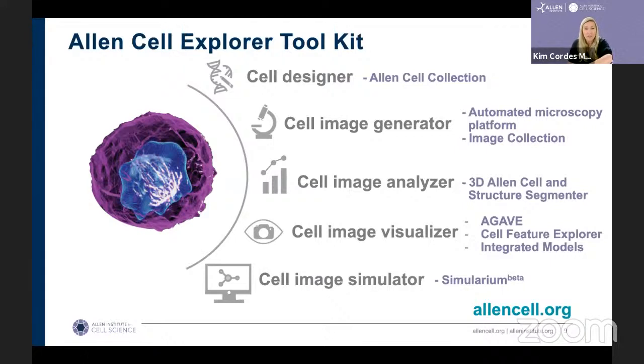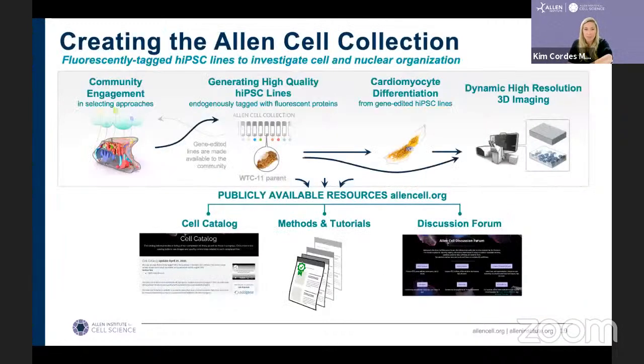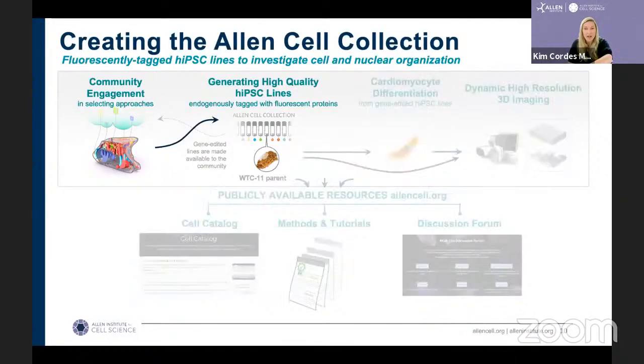Now today, I'm just going to focus on the very top one, the Allen Cell Collection, but stay tuned for future webinars as I will discuss these other topics later on. But also, if you want to know now, you can go to our website to learn more. So coming back to our Allen Cell Collection, I'm going to first focus on our gene editing approach and our QC process.